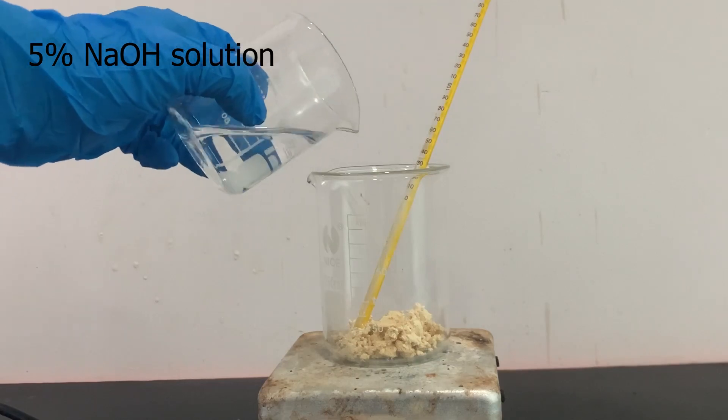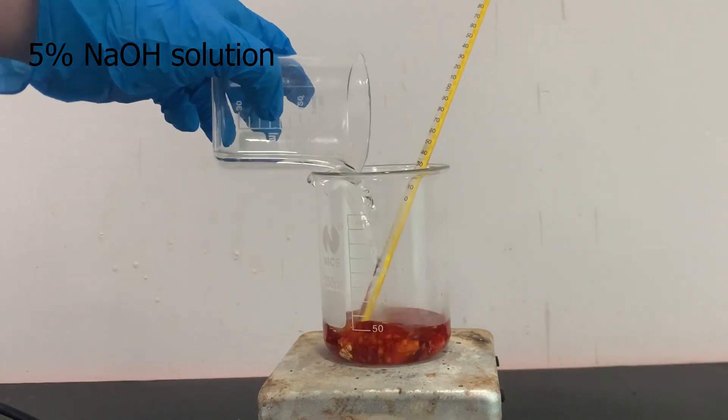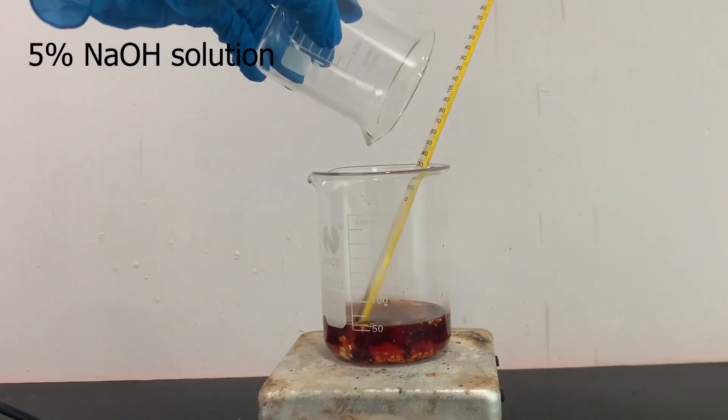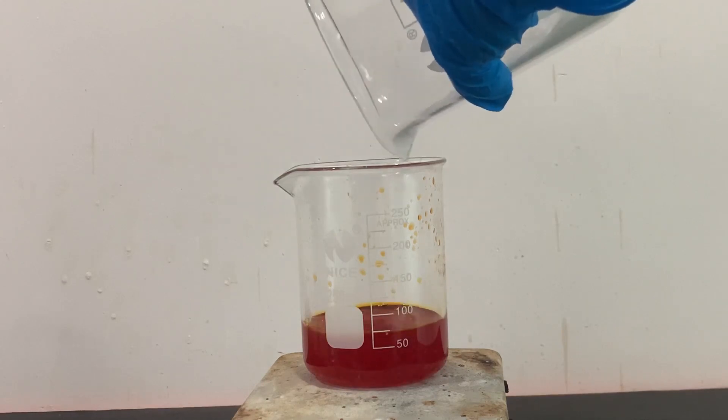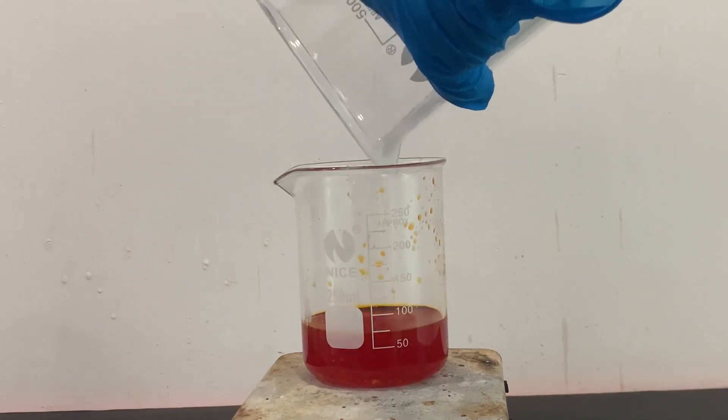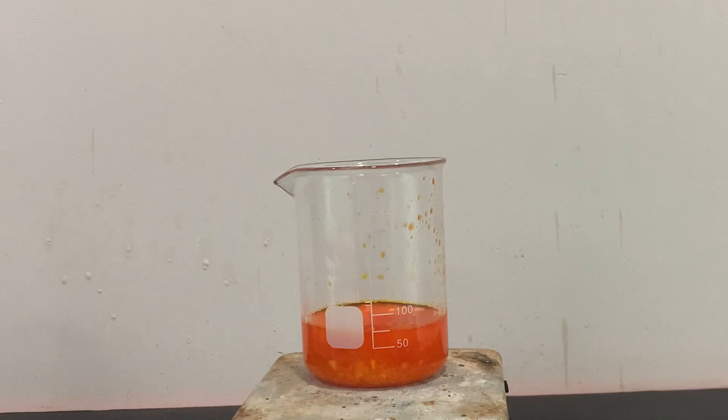The 3-nitrophthalhydrazide is transferred to a beaker and I dissolved it in 50 milliliters of a 5% sodium hydroxide solution. Once everything is dissolved, I started adding 25 grams of sodium dithionite. This will cause the color of the solution to change from dark red to a yellow.